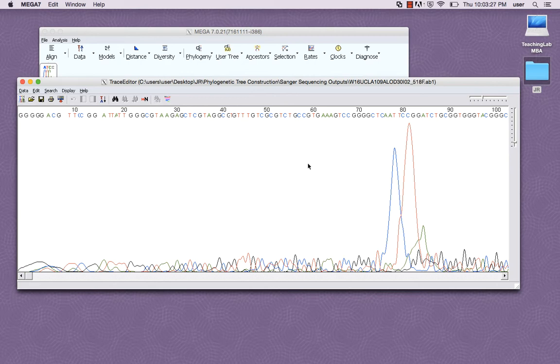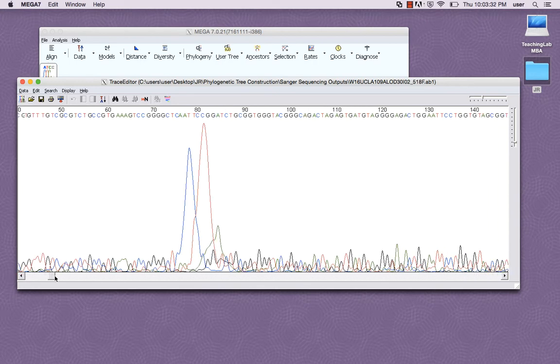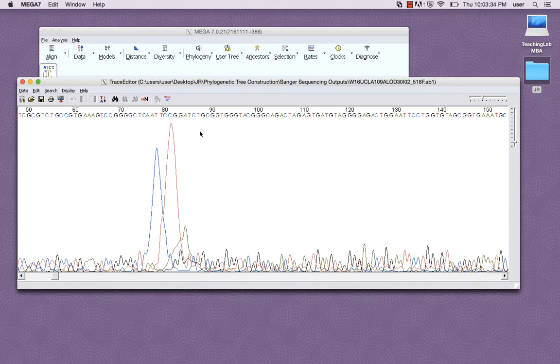Starting at the 5' region, select where in the sequence you'd like to end trimming. I'm going to trim everything before nucleotide position 90. This is where most of the signal ambiguity ends. Highlight that nucleotide and click this button to mask everything upstream of the cursor.